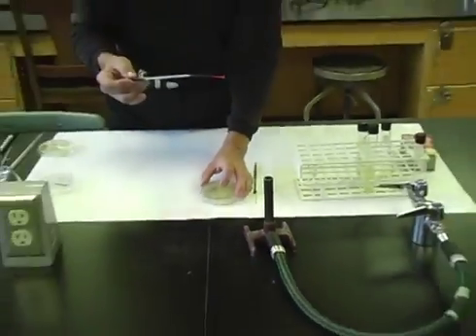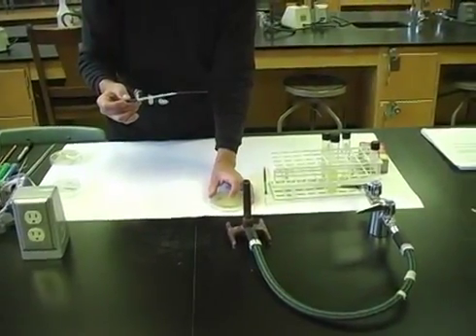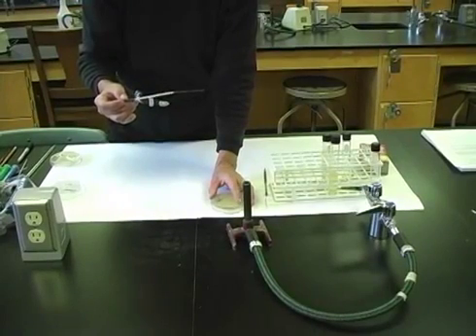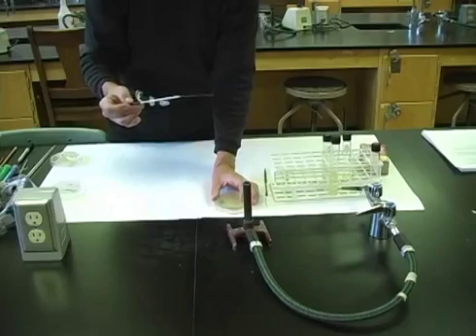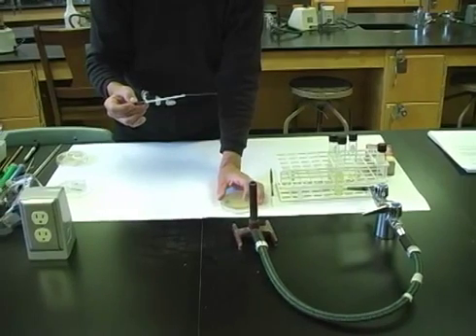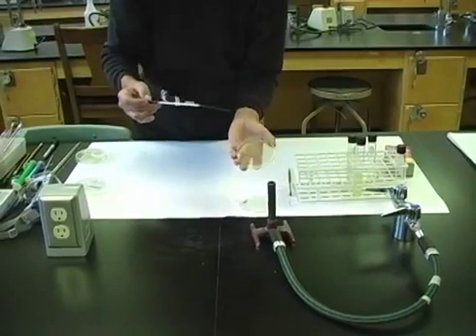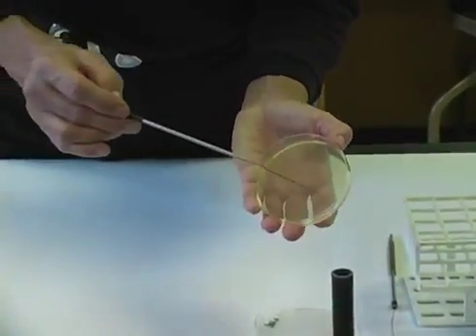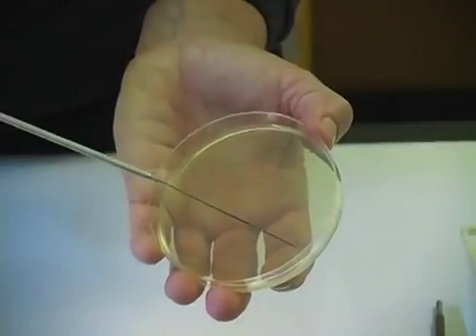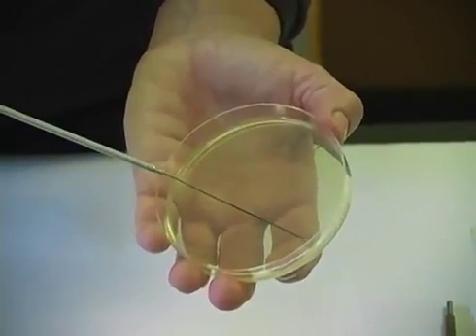And now what I'll do is transfer some of the microbes from the first quadrant to the second quadrant of the plate. It's important that I make sure my loop is cool so I don't heat and kill my microbes. I'll test how hot my loop is by touching it to a portion of the uninoculated plate. If it doesn't hiss and spit, I know it's cool enough.